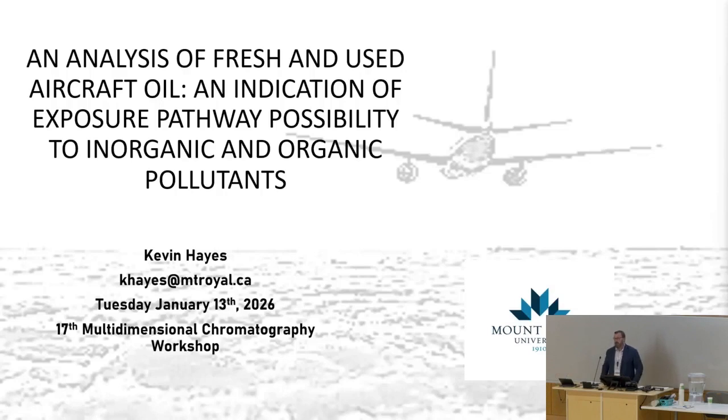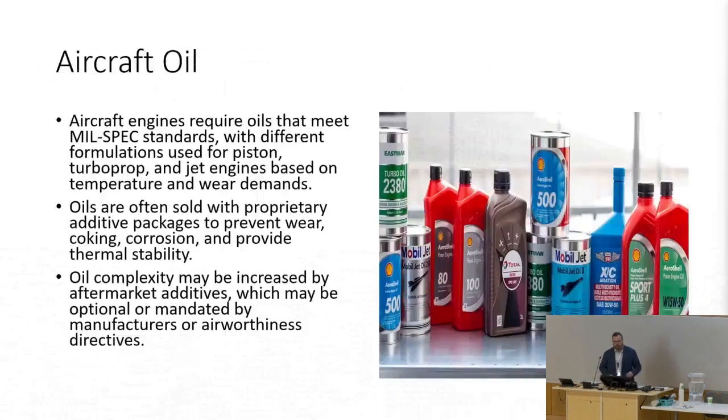All right, great. Yeah, so I am Kevin Hayes. I work out of Mount Royal University. We're doing what we think is some pretty interesting stuff with some aircraft engine oils. We take a little look at them with a bunch of different analytical techniques, but one of those techniques that we like to use is GCGC. So first, I'll give you just a little bit of background.